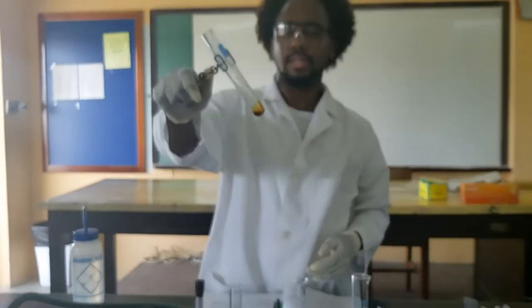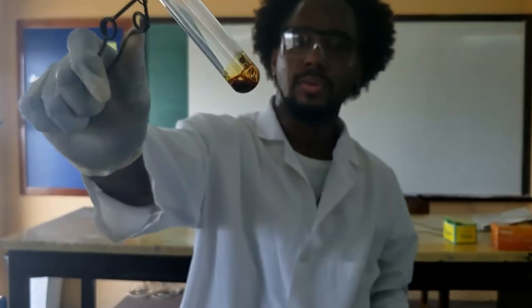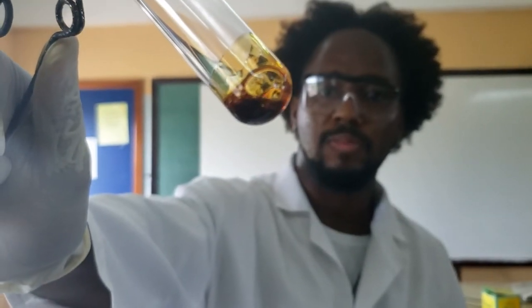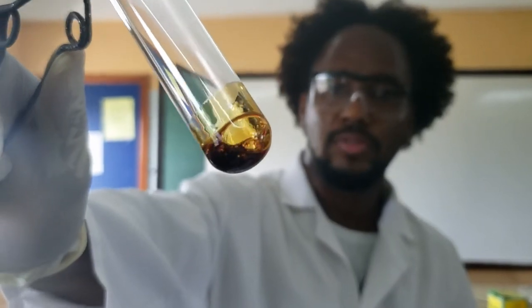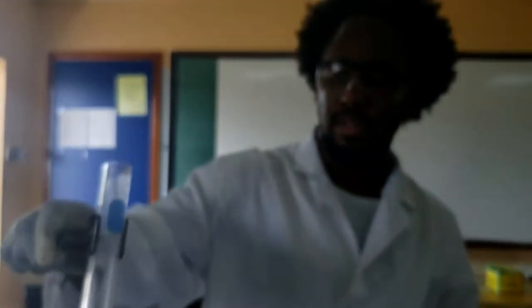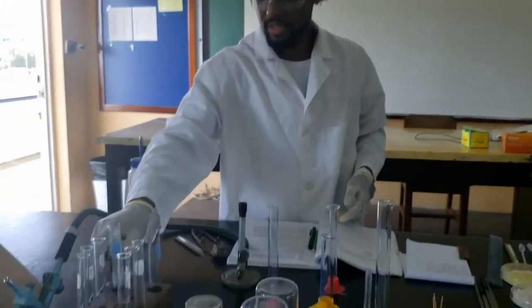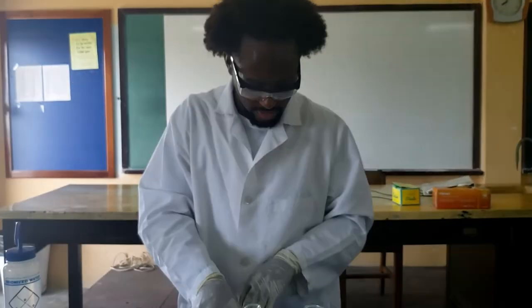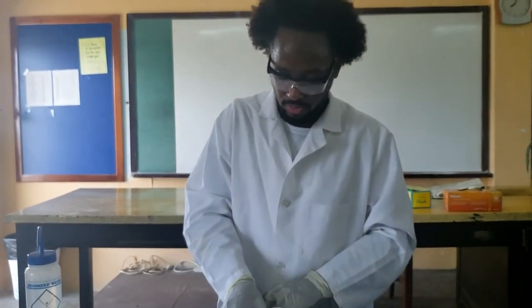Again if you want to look closely, notice it is already getting black. This tube is very hot, so we don't want to handle or wash it as yet — we leave it here for us to clean up later. That is basically experiment number three, and that is a two-part experiment.